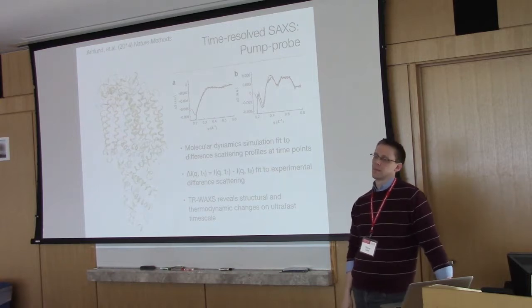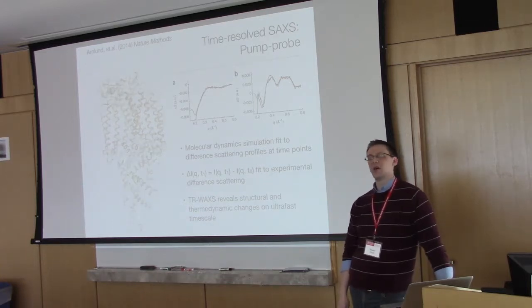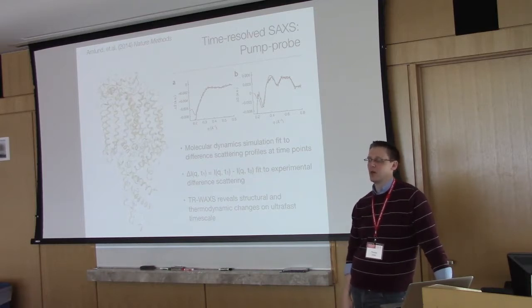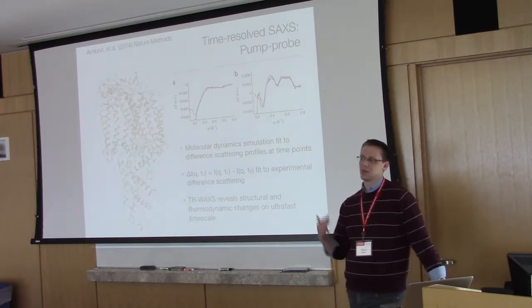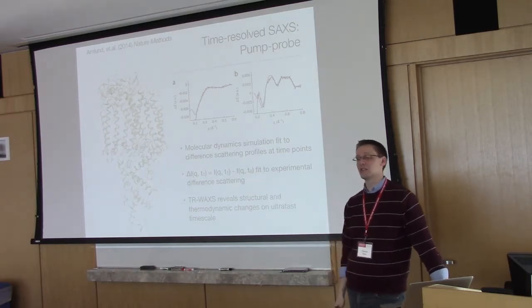And how computationally expensive are these models? Is there any benchmarking? Your average bead model will take, if you run it in fast mode, a minute. If you run it in slow mode, an hour. And you're going to run 10 of them and average it, and the averaging process is usually the longest. So if you want to do something publication quality, expect 5 to 8 hours, something like that.